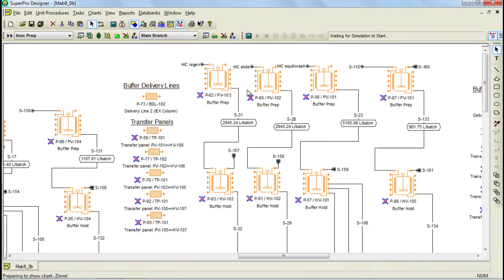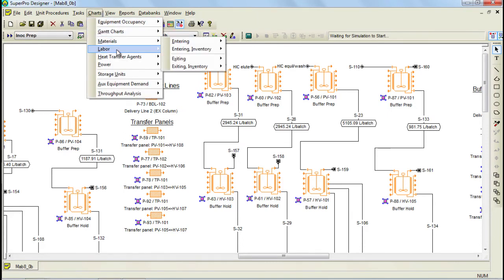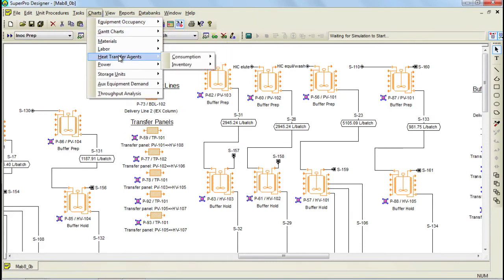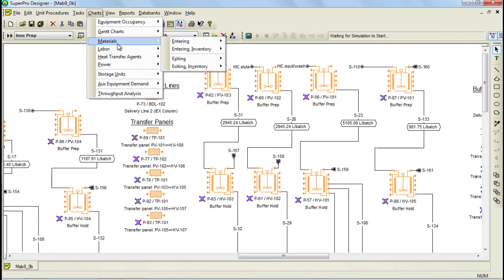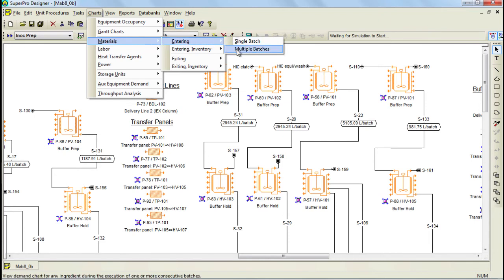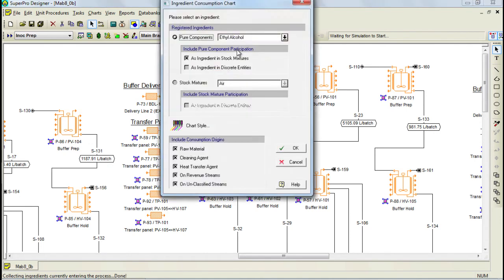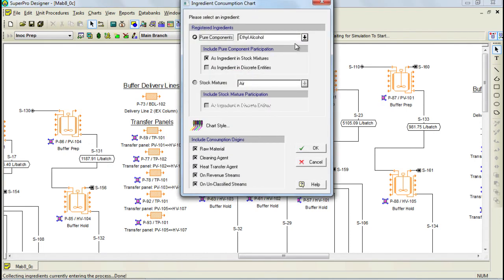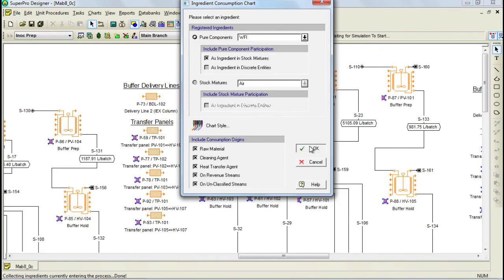Also, the tool calculates and displays the demand for the various resources such as materials, labor, heat transfer agents and power as a function of time. Let's, for example, bring up the chart for the WFI consumption for this process. In this dialog, we need to choose the material of interest, so we scroll down to WFI. And then we press OK to generate the chart.